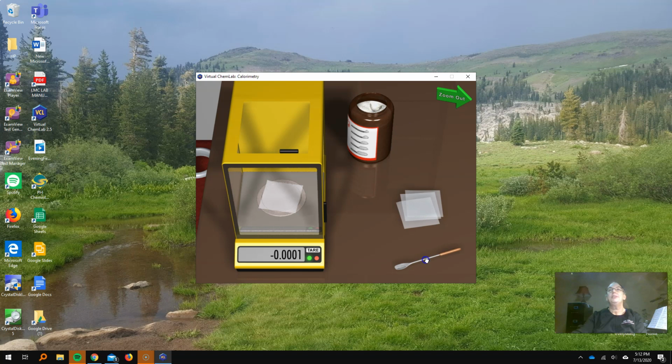Open this guy, grab our scoopula, go in here, grab some. Let me try that again. Sometimes it's not easy to grab this. Oh, nothing. Come on. Grab some sugar here. Oh, come on, computers. There we go. Put it over there. Let's try one more time. The joys of computers, huh? There we go. Alright, so write that one down for the sugar.